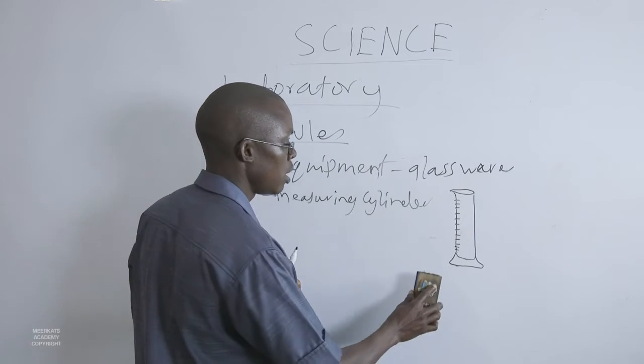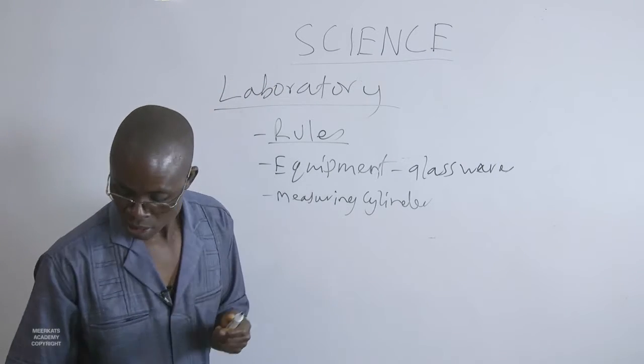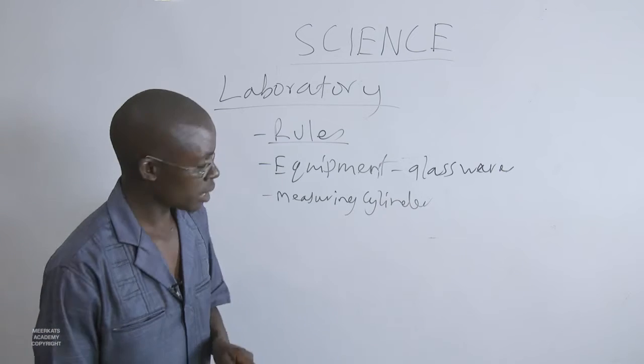Another glassware that can be used is a pipette.